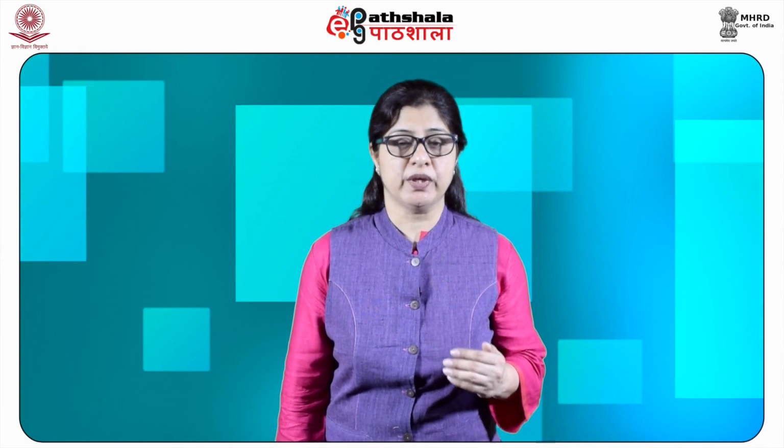Ion exchange separations are mainly carried out in columns packed with the ion exchanger. There are two types of ion exchangers, namely cation and anion exchangers.